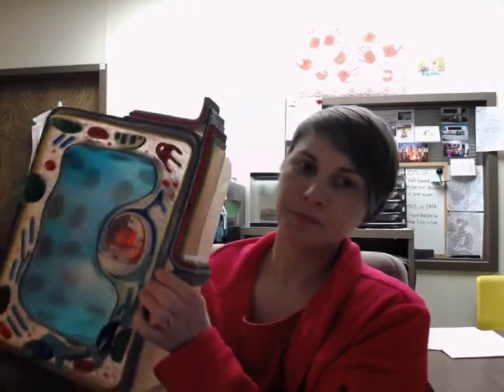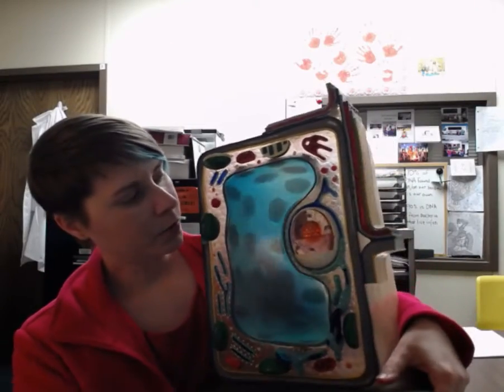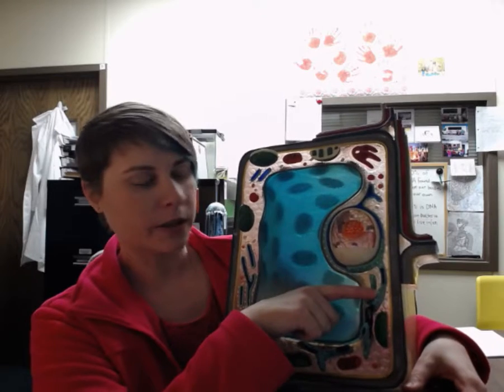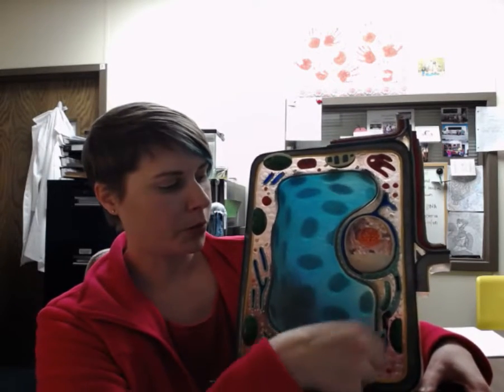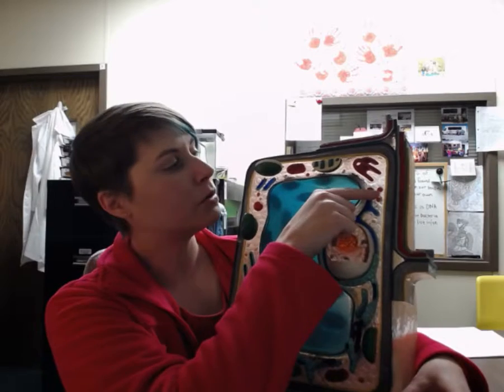And then we also have our plant cell. Here, let me put it right here so it's better in front of the screen. We have the nucleus, the nucleolus. We have the rough endoplasmic reticulum, the lighter one with the white dots on it to represent ribosomes. And then the darker part is going to be the smooth endoplasmic reticulum. Golgi apparatus up here with the vesicles.